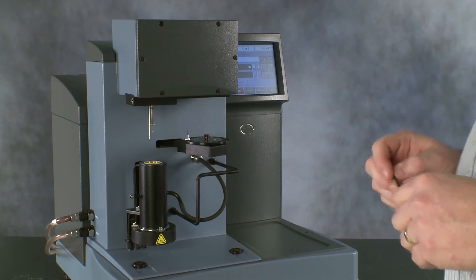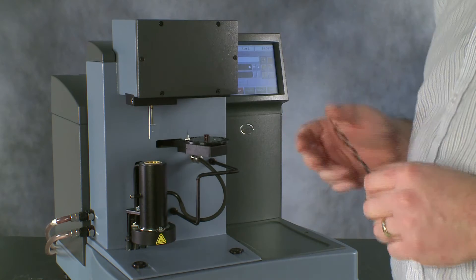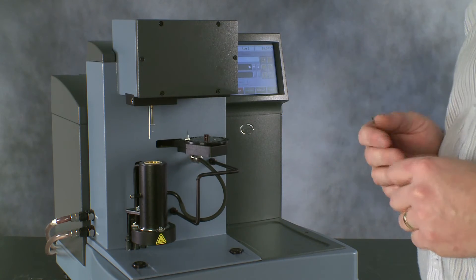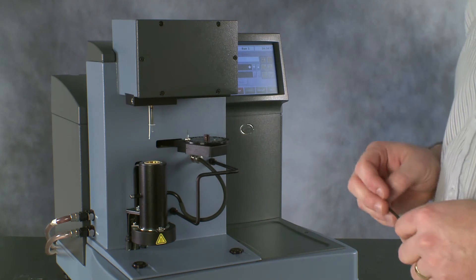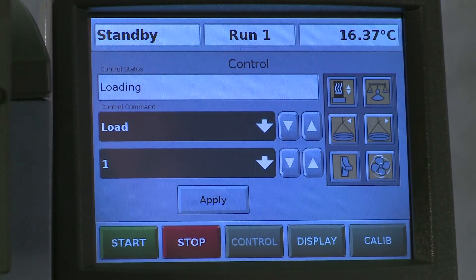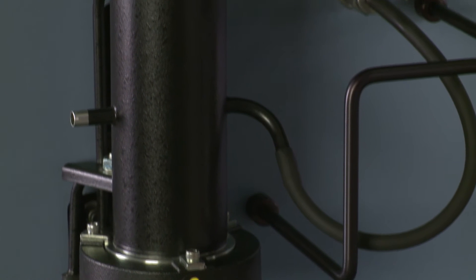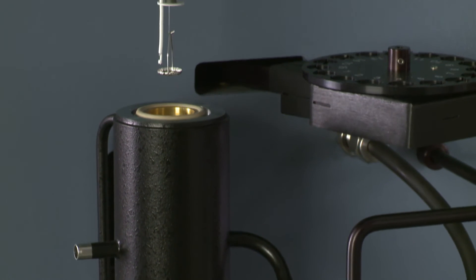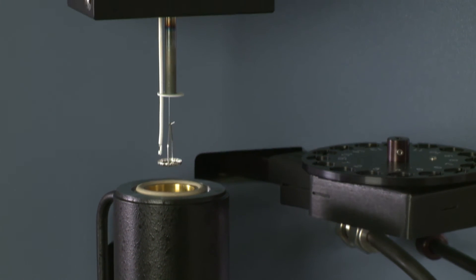Now our hang down wire has been replaced, we need to make sure that our hang down wire is well aligned with our furnace. And the way we do that is to load a pan up. Once the pan is loaded, we can stop the furnace so that it's level with the pan and we can see how well aligned it is.